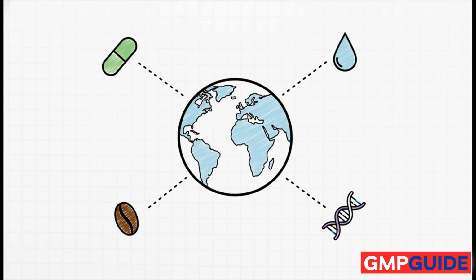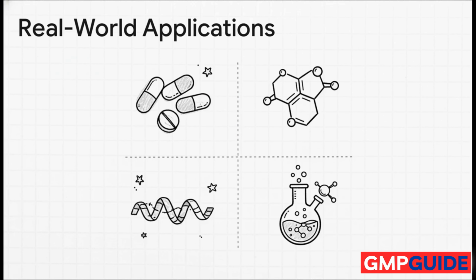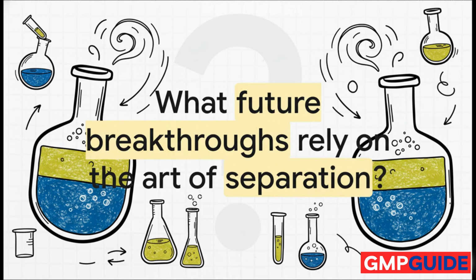So, why does all this clever chemistry matter? Well, it's not just for the lab. It's absolutely essential for purifying medicines like antibiotics and insulin. It's a cornerstone of biochemistry. This fundamental technique is unlocking new possibilities in science every single day.